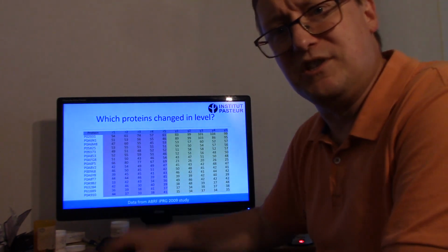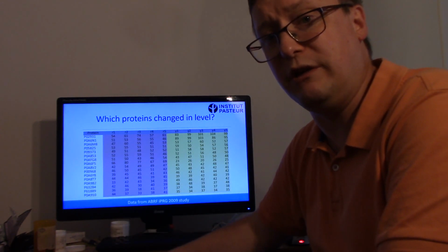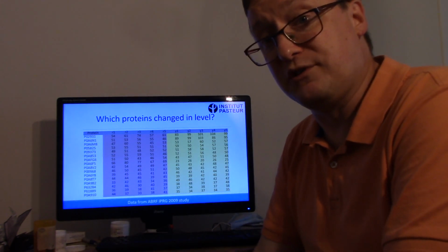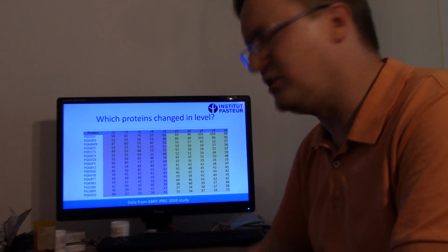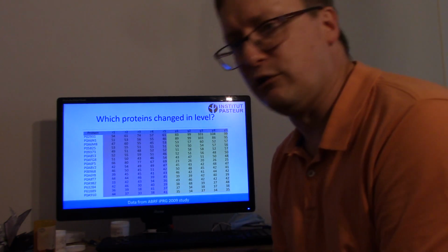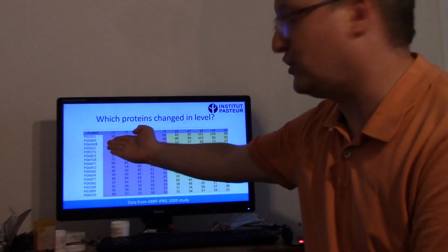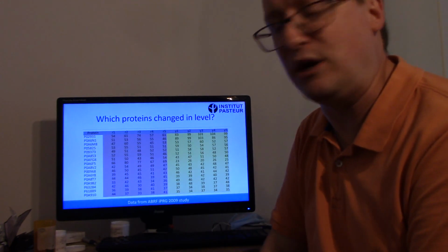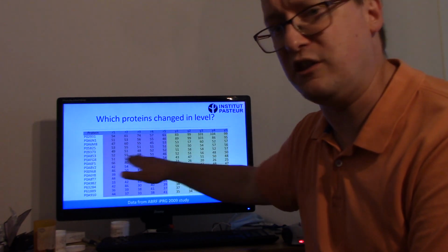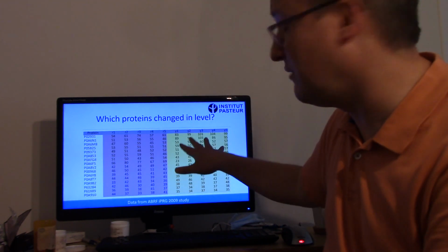A lot of times, the data that come from spectral counting experiments look something like what you see on screen right now. In this case, we're looking at real data. These were produced in 2008 for a 2009 study of the Association for Biomolecular Resource Facilities. In this case, we had 5 shots, 5 LC-MS experiments representing red E. coli. These are technical replicates rather than biological. And over on the right, we have 5 shots from yellow E. coli.